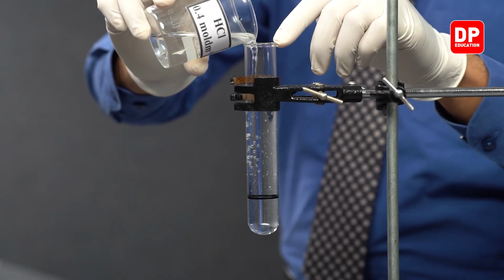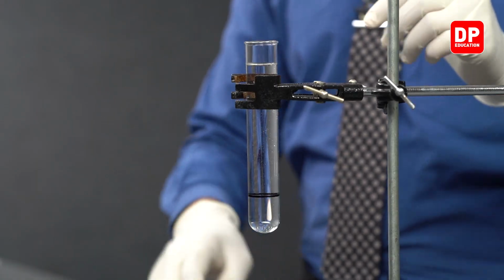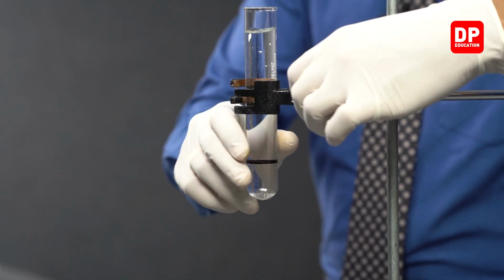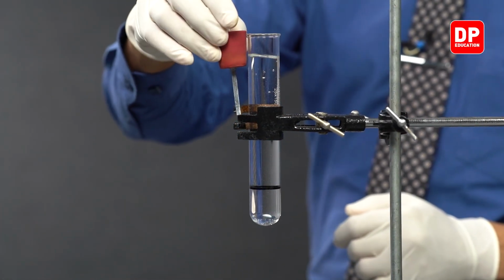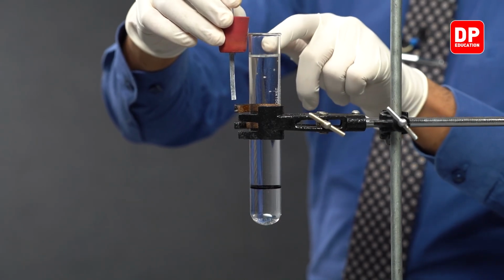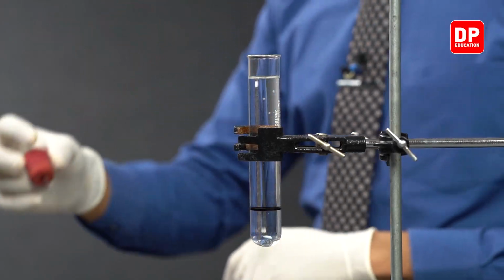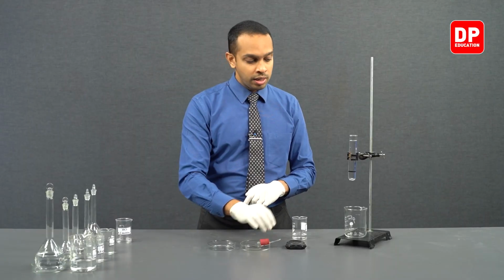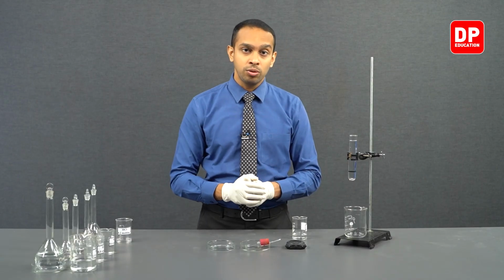Now students, this is very important. If you leave a small gap like this, and then place the rubber stopper, there's going to be a small air gap between the stopper and the water level. This would result in an already filled amount of gas in the boiling tube.